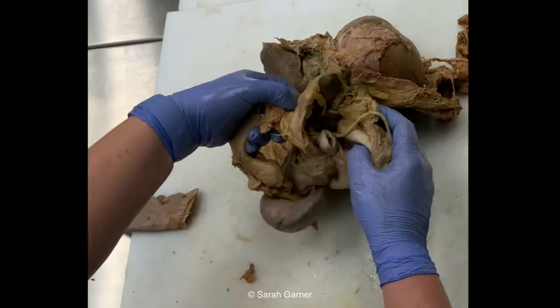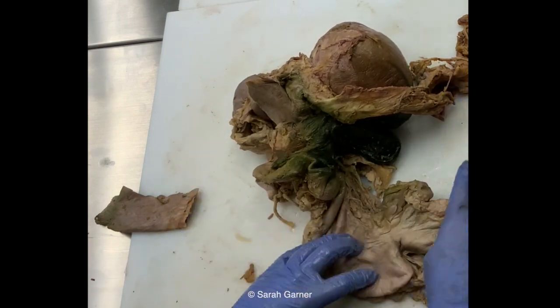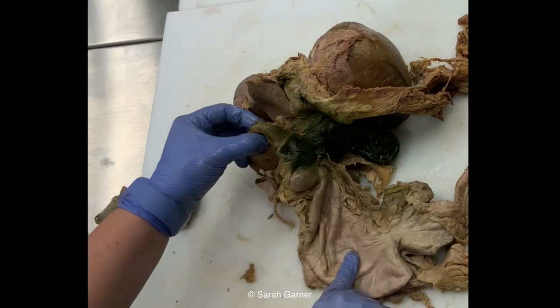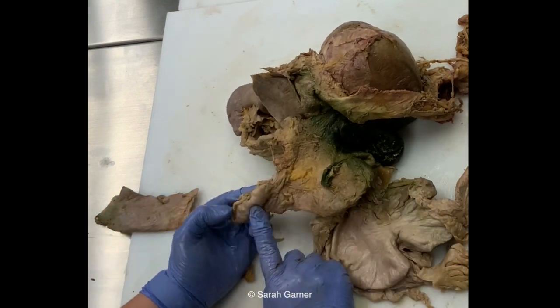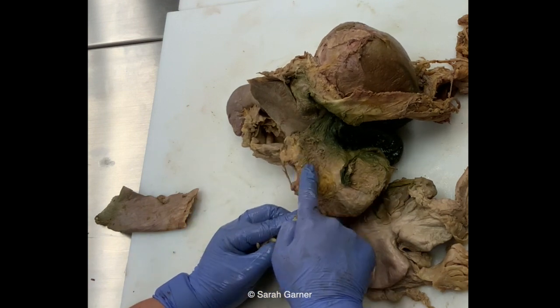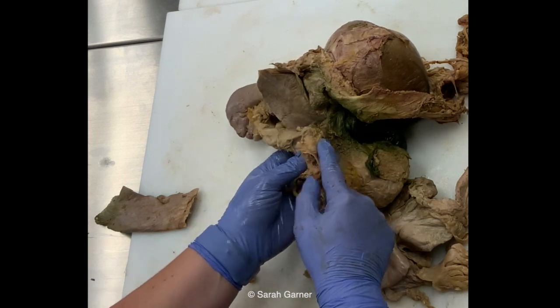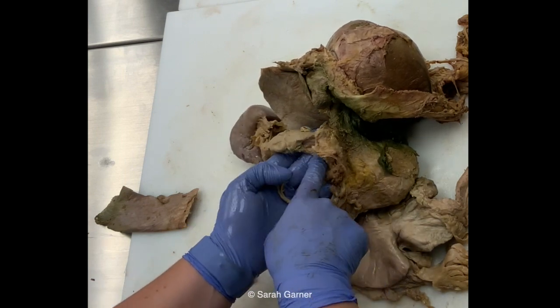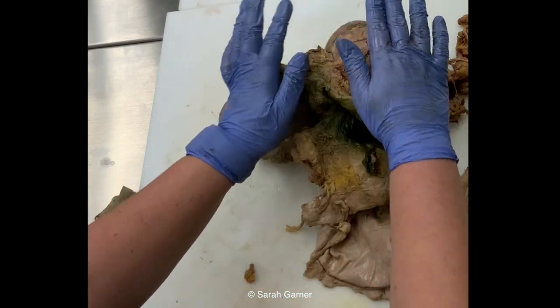So with that, to orient you: esophagus, stomach, pylorus, duodenum, where we tied off right in between where duodenum is changing to jejunum here, okay? Uncinate process and head of pancreas, what's left of the superior mesenteric vessels, neck of pancreas, body of pancreas, tail of pancreas, spleen, liver, okay?